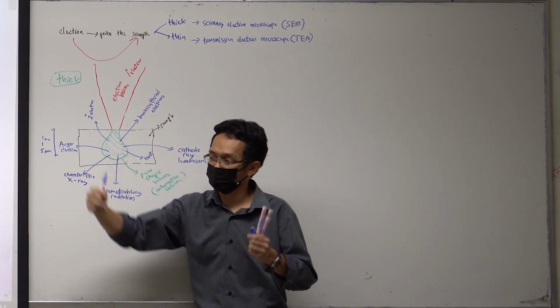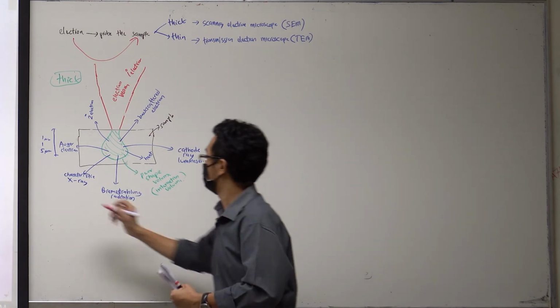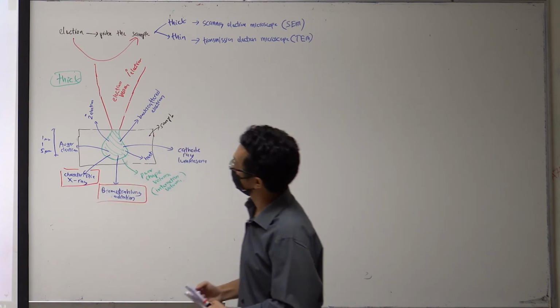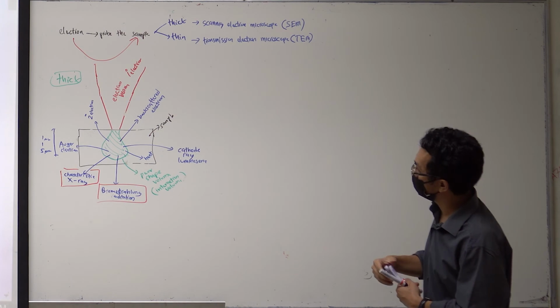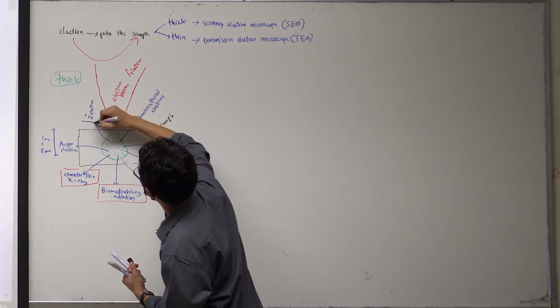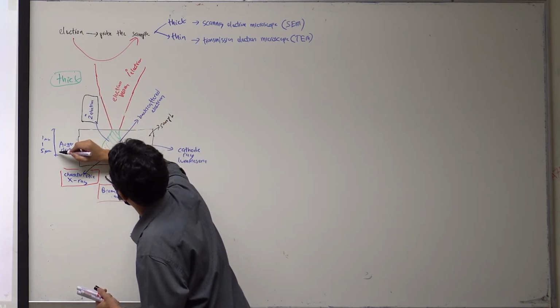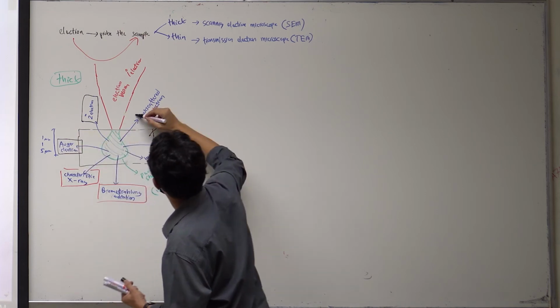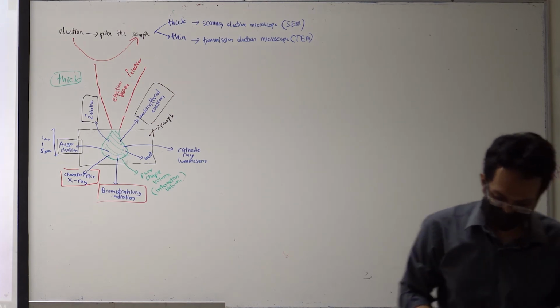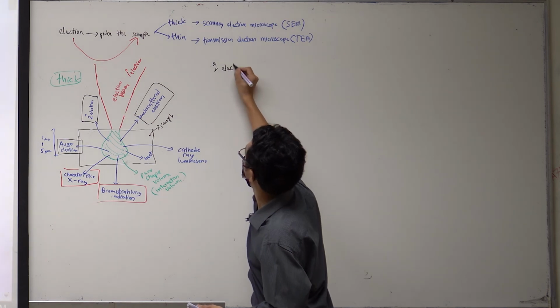They have a lot of things because electron will interact with another electron. So we have covered the characteristic X-ray. What does it mean by that? We have covered this Bremsstrahlung radiation. Let me cover three things only: the secondary electron, and then Auger electron, and then backscattered electron. Okay, let's start with the secondary electron.